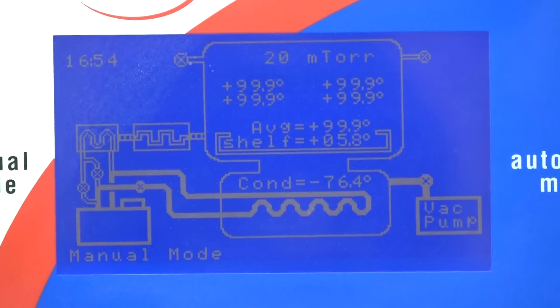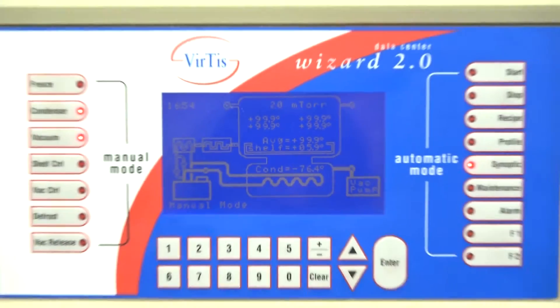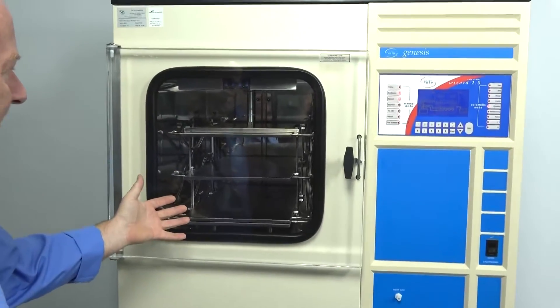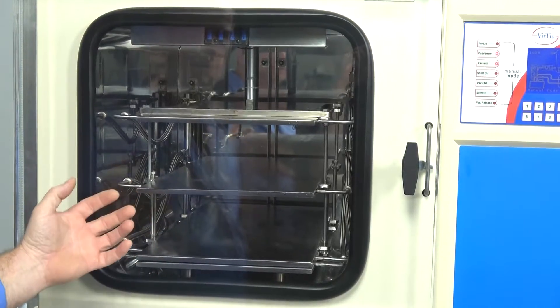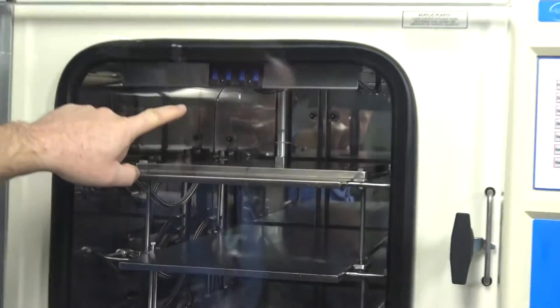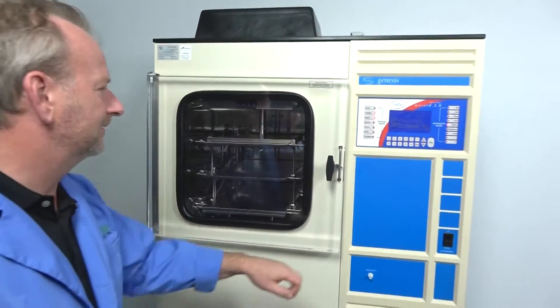This is almost the pilot stage of doing a lot of freeze drying, and it has both a drying oven and freezing. Some of the options include shelving with stoppering. This particular model has automated hydraulic-driven shelving — you can see the hydraulic cylinder in there — and it essentially moves the shelves down to stack all of your vials for stoppering.